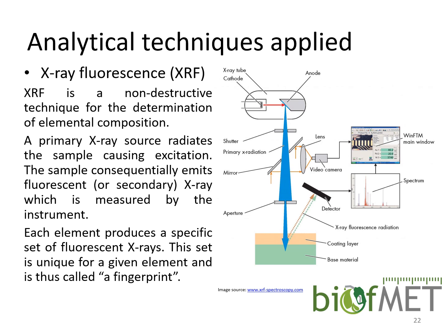So that's why it's harder to assess the type or the form of a certain element as it is present in the sample. When you destroy the sample, you transfer all of that element into one form, so it's sometimes hard to do the speciation. For this type of analysis, you don't need to prepare the sample in that way.